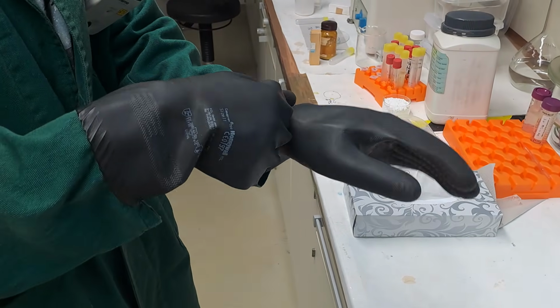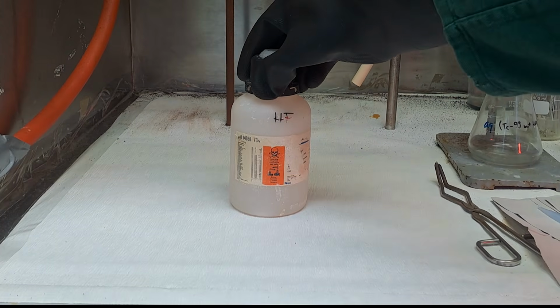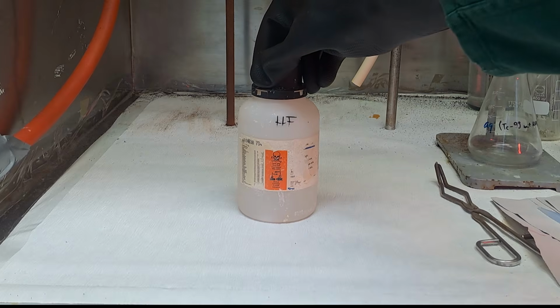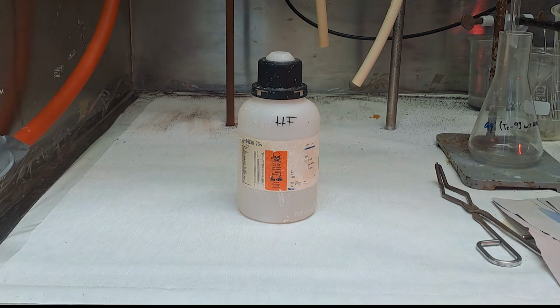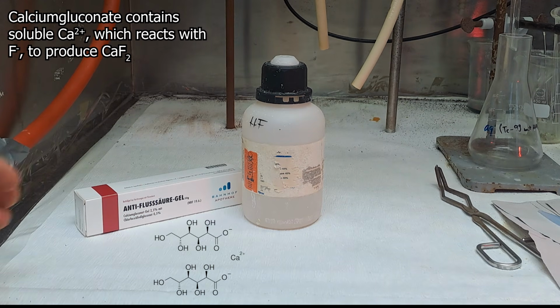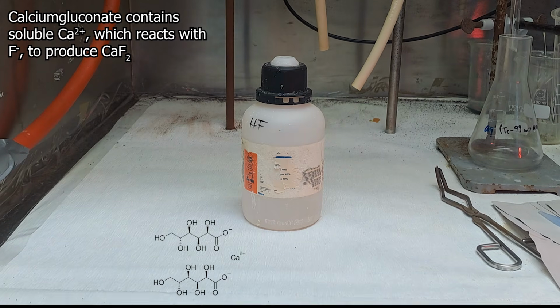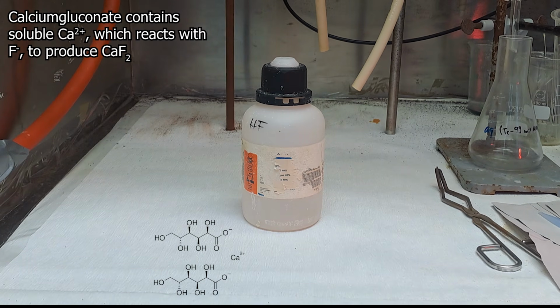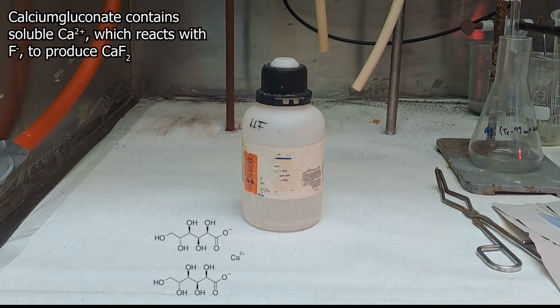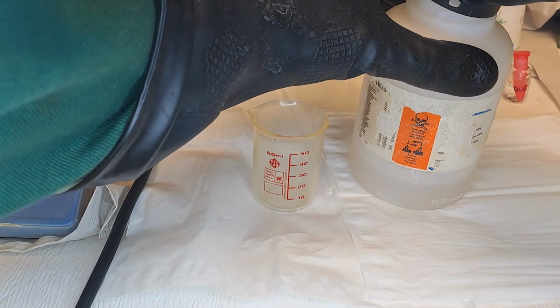Now I put on some heavy duty gloves because concentrated hydrofluoric acid is being taken out of the cabinet. Whenever working with concentrated hydrofluoric acid, it is mandatory to have calcium gluconate ointment on hand. Calcium gluconate is really for minimizing damage. It is applied on the affected area where the calcium is supposed to convert the fluoride ions into insoluble calcium fluoride. This disclaimer is far too short, but this also isn't just a tutorial to try at home anyways.